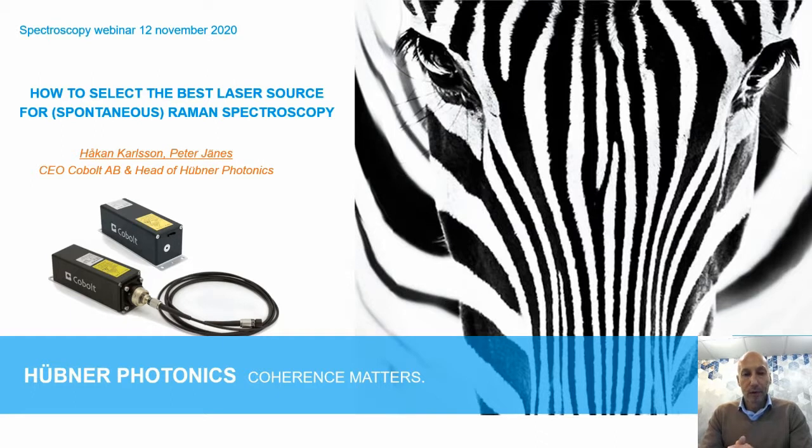I should say here from the beginning that we are limiting the scope of this presentation to be about spontaneous Raman spectroscopy. So we're mainly going to talk about single CW lasers. If you are interested in stimulated Raman spectroscopy or coherent anti-Stokes Raman spectroscopy using ultrafast lasers, I should warn you that you're probably not going to find much of interest in this presentation.